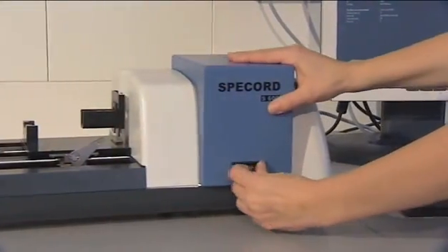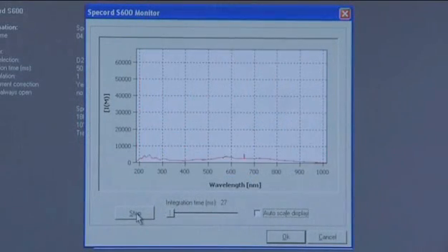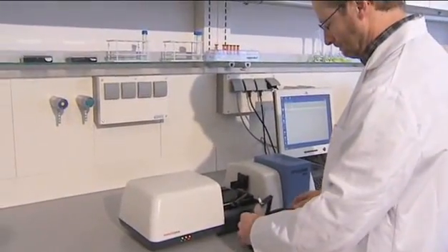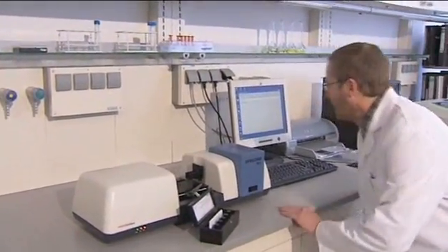Light sources are easily accessible and interchangeable. The combination of deuterium and halogen lamp ensures a high light yield through the complete spectral range of UV to NIR. A self-adjusting photometric linearity and an automatic stray light correction are additional advantages of the Specord S600.